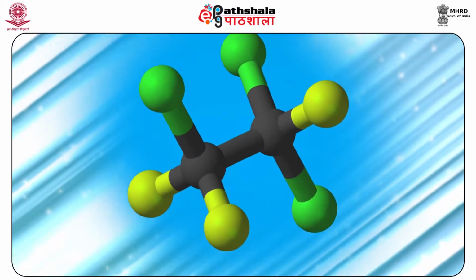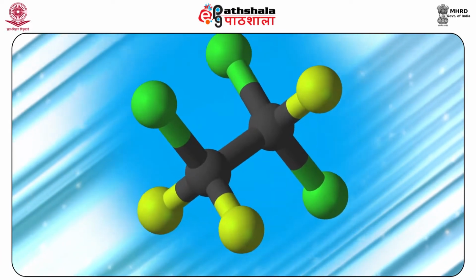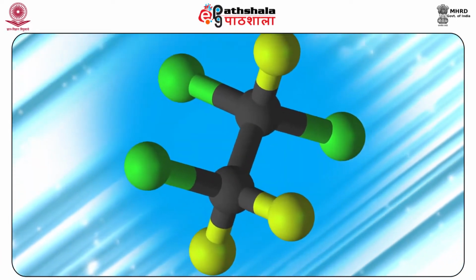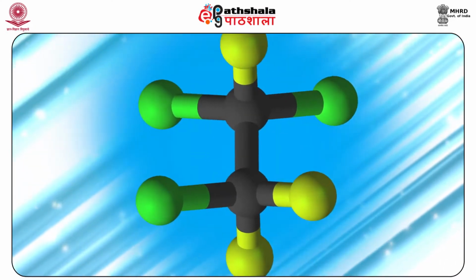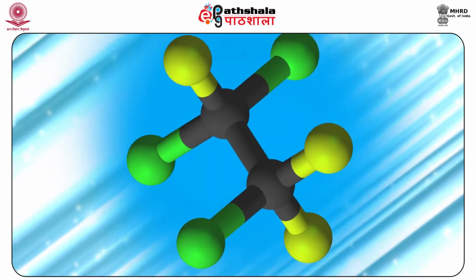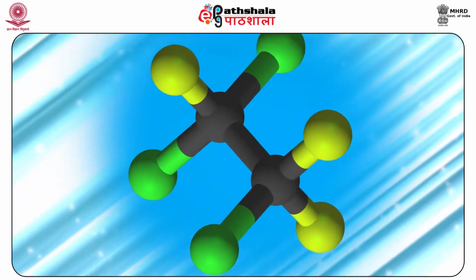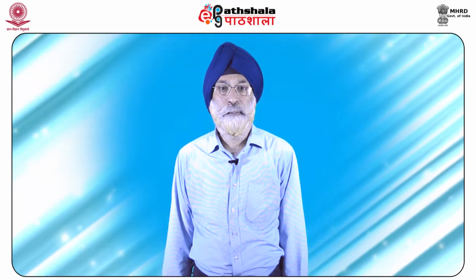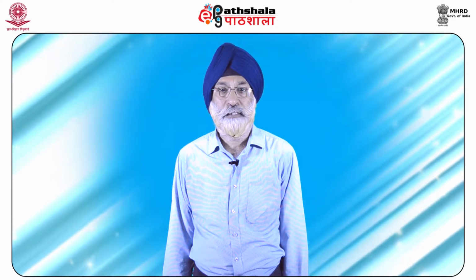Freon 113 belongs to a class of compounds called chlorofluorocarbons. These compounds are being banned under the terms of the Montreal Protocol on phasing out of ozone depleting substances. There is therefore a need for a suitable replacement of Freon 113.